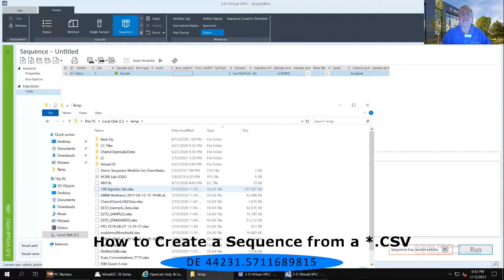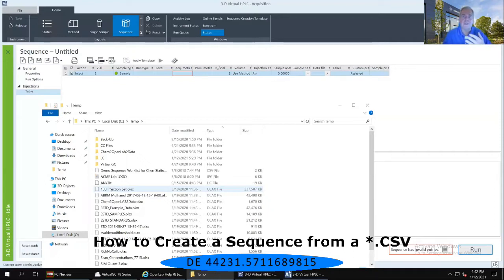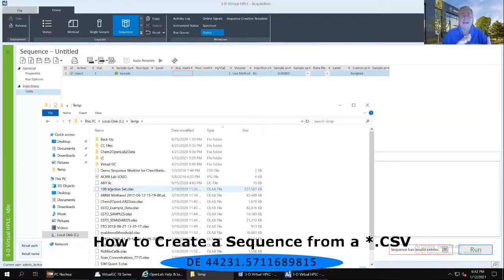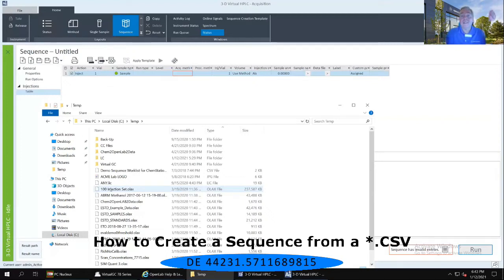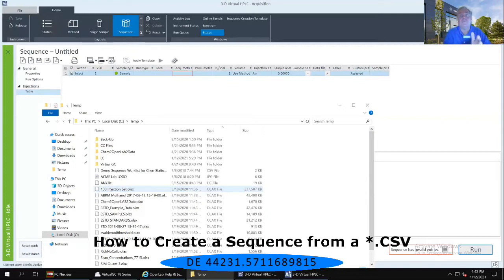This is a specific example for those of you that might have a LIMS system. Or let's say that if I don't have a LIMS system, I get a list of injections that I need to run today. I come in in the morning, I open up my Outlook. My boss has sent me a list of 35 different injections I need to run today. Well, that list exists as an electronic list sitting in my Outlook.